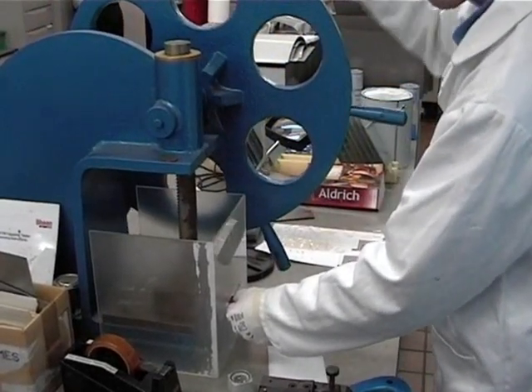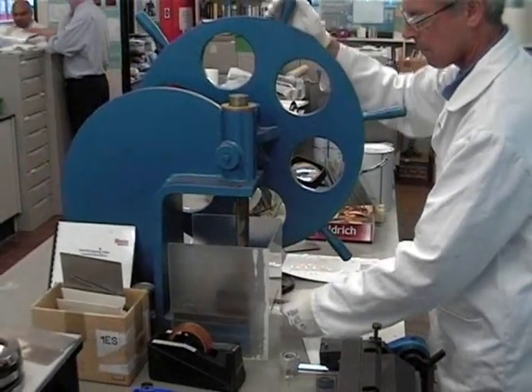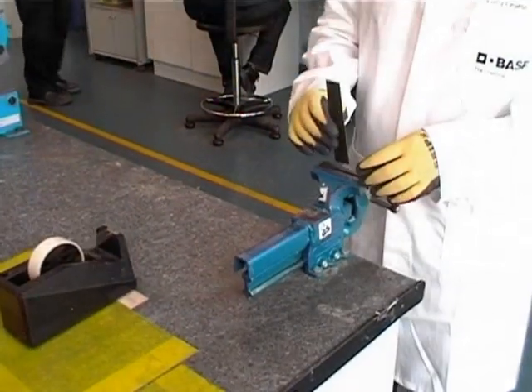This test can either be done using a standard benchtop vise, or using special equipment such as the folder and flywheel press shown here, but in either case the basic operation is the same.